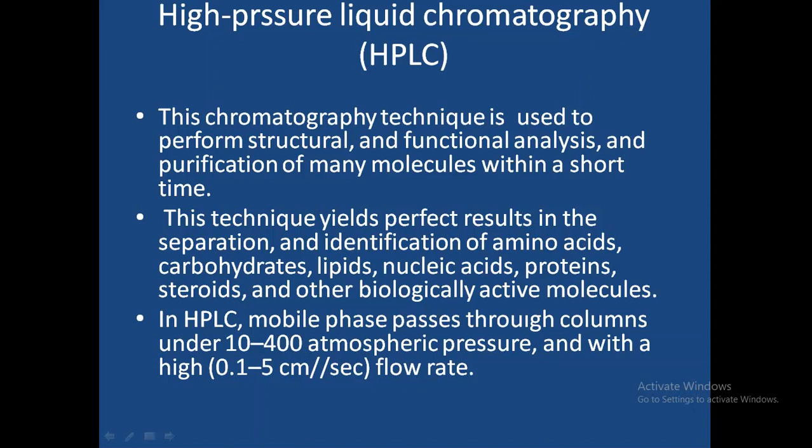This technique is used to perform structural and functional analysis and purification of many molecules within a short period of time. Even though it is expensive, the time taken for the separation is very short, and the method of handling is also very simple and efficient.